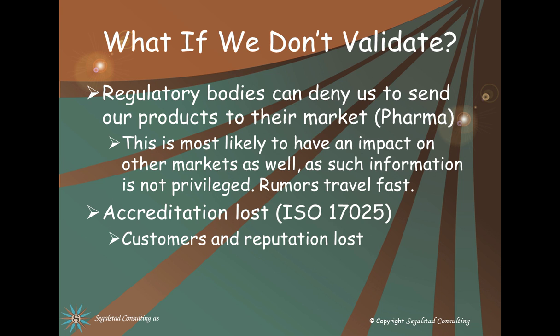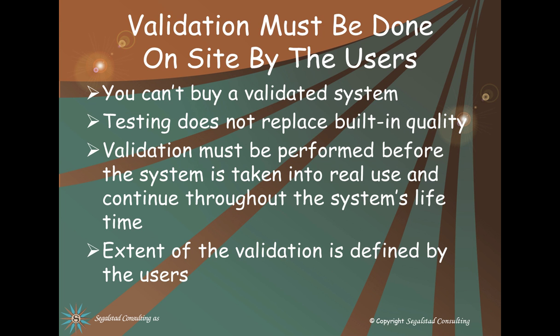So what if we don't validate? For pharma, regulating bodies like the FDA can deny us to send the products to the market. Other labs like contract labs or calibration labs may lose their accreditation. And regardless what industry you're in, the consequences are big.